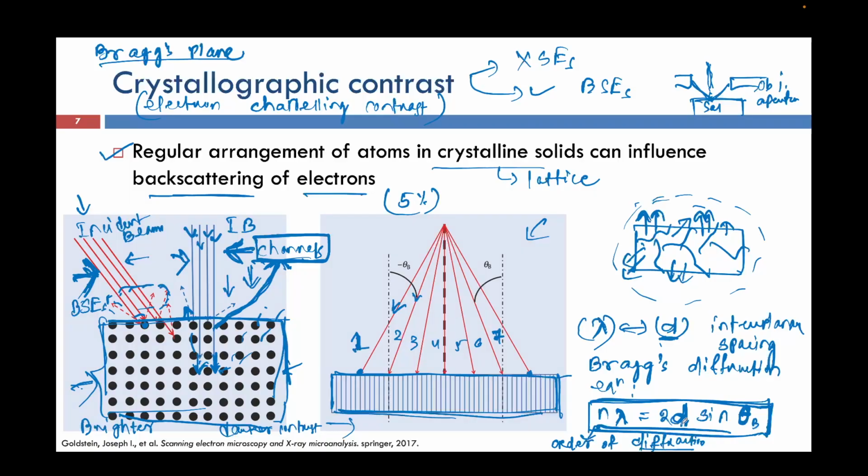Okay. The reason I brought up the scattering phenomena is that we have to go a little bit deeper into X-ray. Bragg's law is an oversimplified version of the actual diffraction law. The actual diffraction is where scattering actually happens. When you talk about X-ray, there is another diffraction called Laue diffraction.